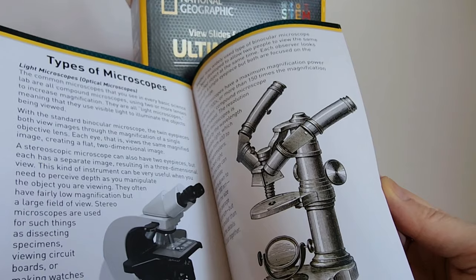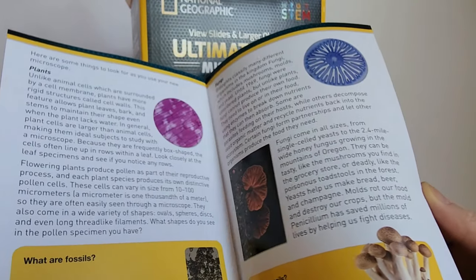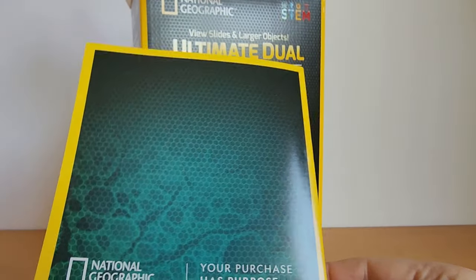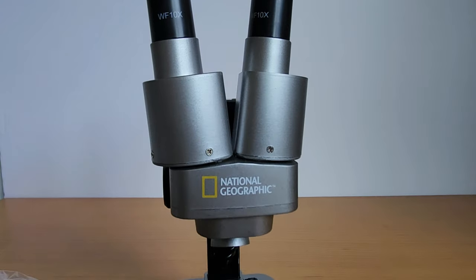This is a great starter microscope. It comes with this really informative booklet, which has lots of information about the microscope and how to prepare your own slides. It's a great learning guide to get introduced to the microscopic world.